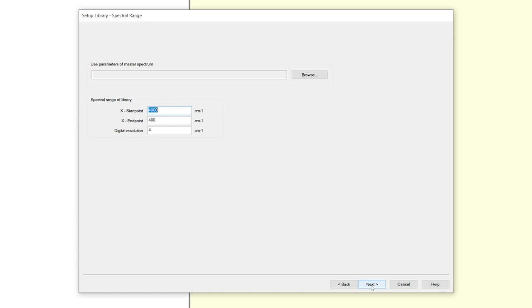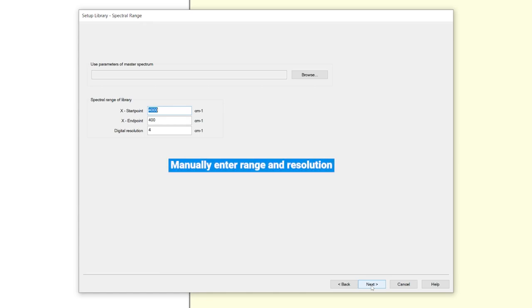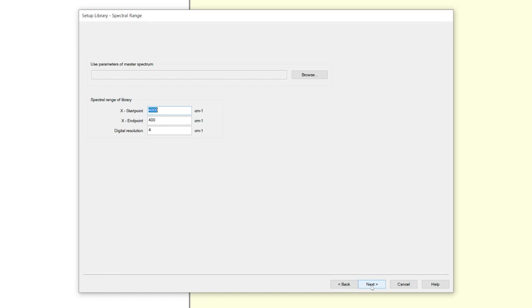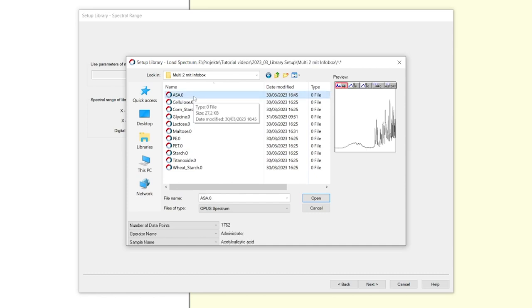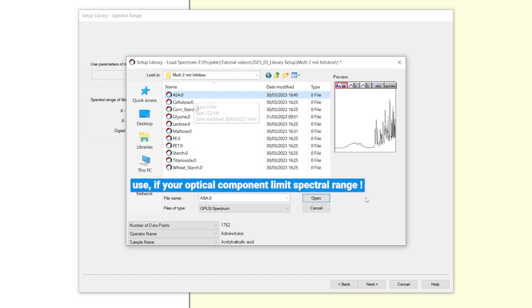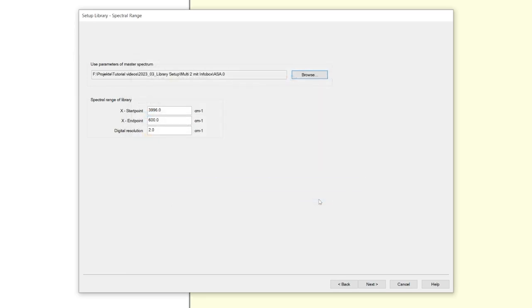You have now two possibilities. You can manually enter the spectral range and resolution of your library, or select a master spectrum. OPUS will automatically obtain the required information out of the master spectrum. To restrict the parameters is useful, for example, if your optical component limits the spectral range. Afterwards click next.